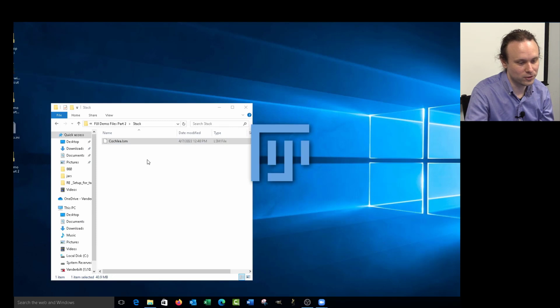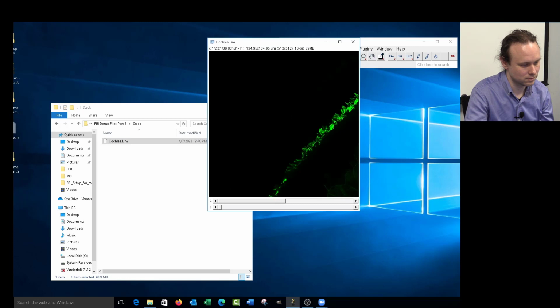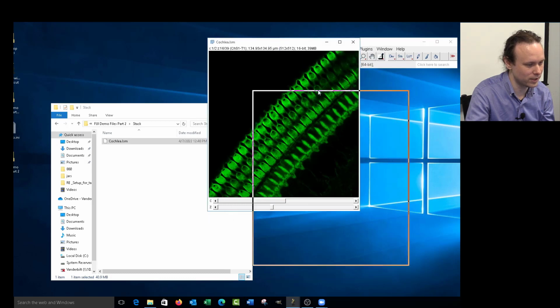All right, do we have any questions while we're waiting for FIJI? There's one question in the chat: how can you save a 2D picture of the volume for publication? Okay, that one we can do.